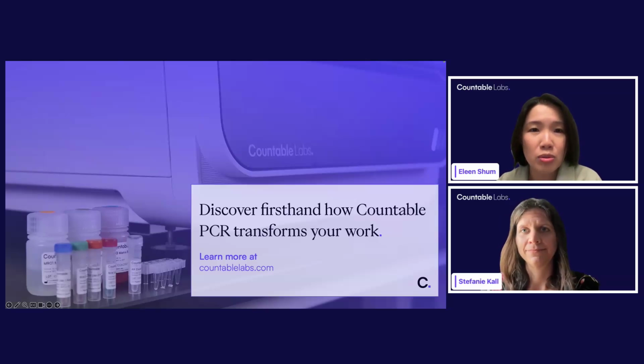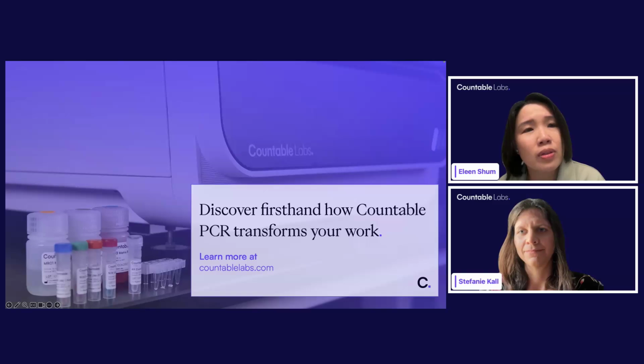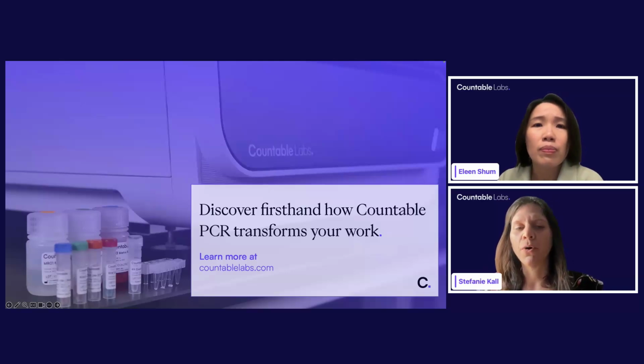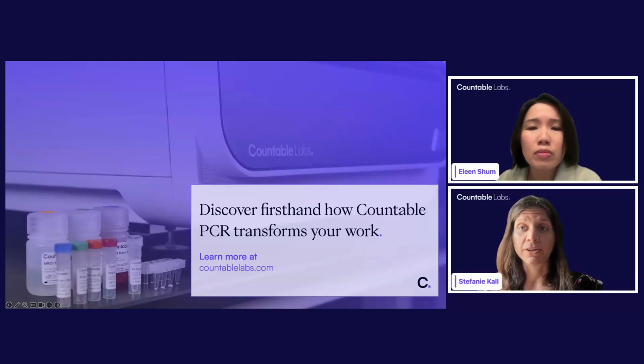Okay, thank you for the question. Let me scroll down a bit. Somebody is asking whether we can detect RNA, or use cDNA? It's probably for lentiviral workflows. It's a great question. Yes, you can. We have a one-step RT-PCR kit coming out soon that will be usable for this.